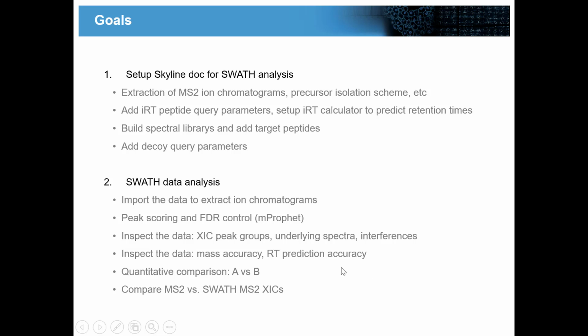And basically, the instructions are all written down for you there in these tutorials. So just grab the, and it should be in this directory, DIA LFQB. So just grab a handout and get started, and we'll be here if there are any questions.